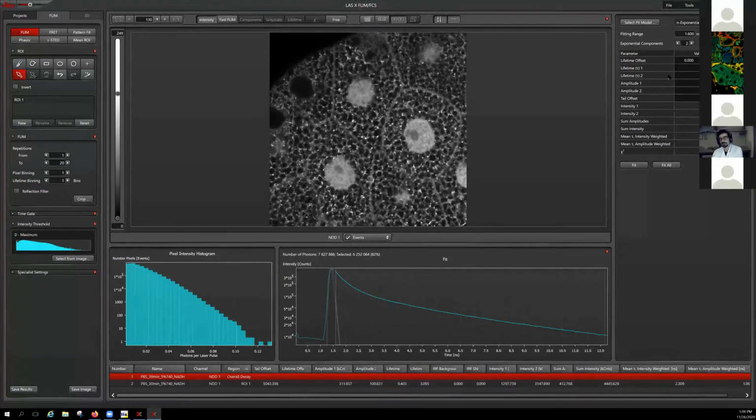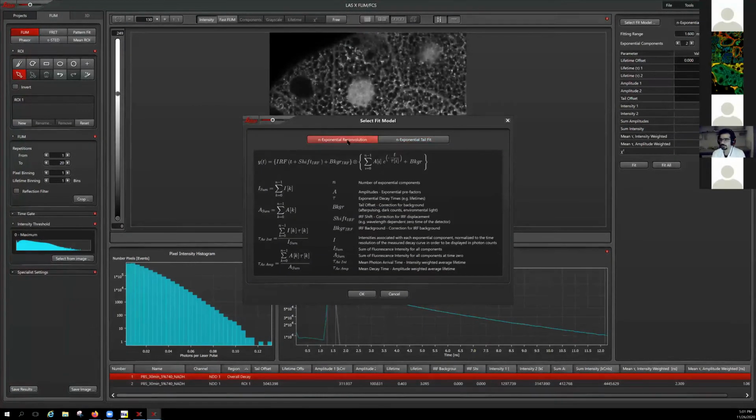As I showed you in the presentation, we have this formula for the multi-exponential decay fit, and we have also seen it here for the reconvolution, that the amplitude is a contribution or the fraction of different lifetime components. Tau 1 and tau 2 are these lifetime components, so one of them can be short, long, they can be very close, not too close.